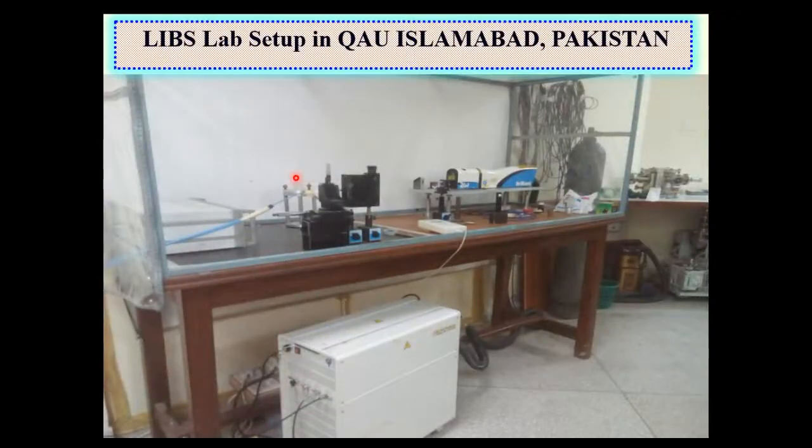So this is a LIBS technique, a LIBS setup at Quaid-e-Azam University, Islamabad. We have recorded our data from this lab. This is the main source, known as the Nd:YAG laser. This is a power supply, and this is a delay generator, and this is a sample holder, and this is basically our probe, and this is our spectrometer, and this is a reflecting glass.